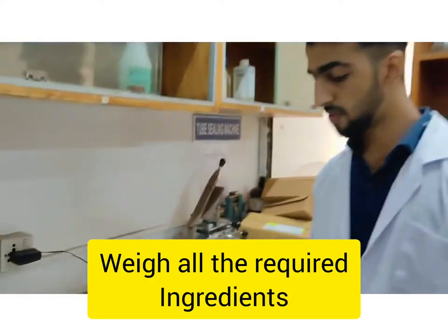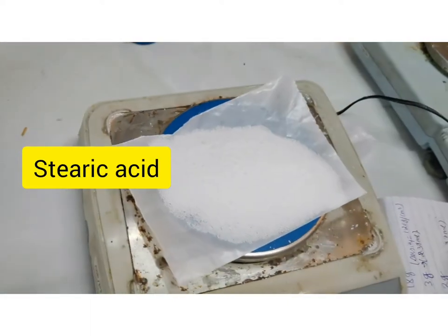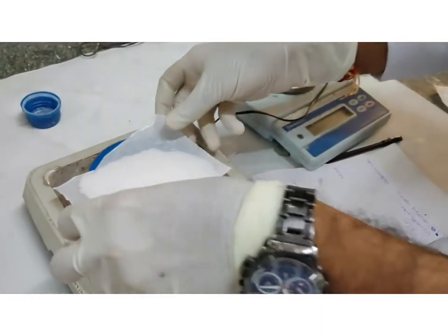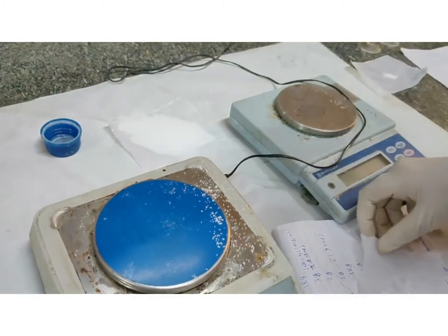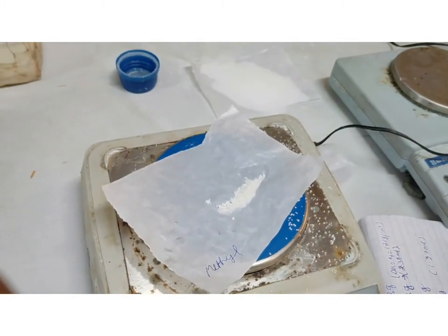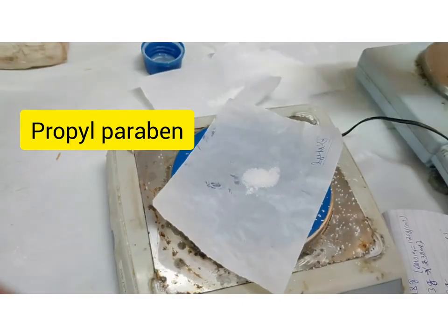Now we are going to prepare different salts for the preparation of vanishing cream. First we are going to take stearic acid, which is 18g. Now we will take methylparaben, which is 0.18g. Now we will take propylparaben, which is 0.2g.